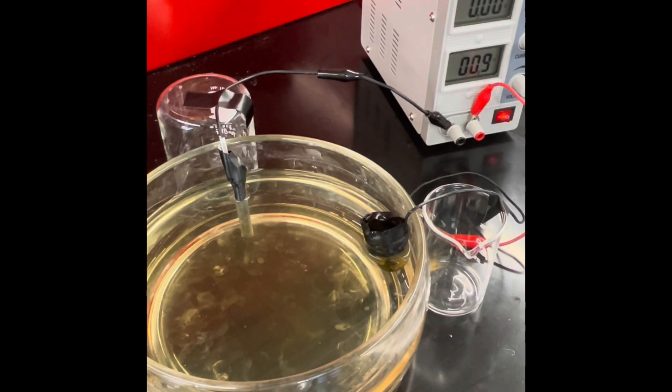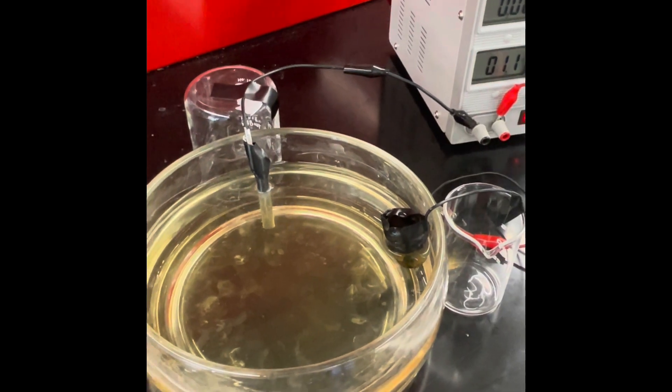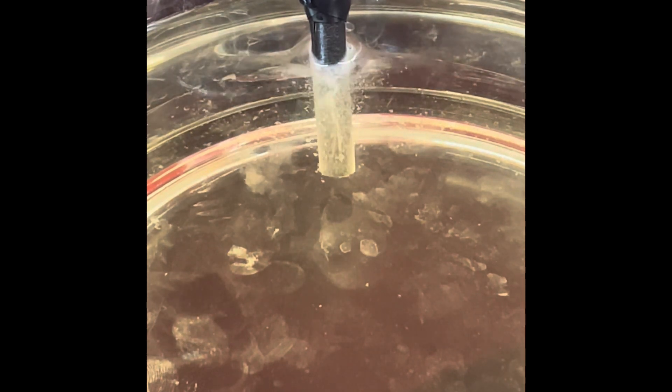At first not much is happening, but as I begin to turn my voltage up, my current increases and you can see bubbles forming on our cathode. These bubbles are hydrogen gas made by the electrolysis of water. As I adjust the voltage, I can adjust the rate at which hydrogen gas evolves from our cathode.